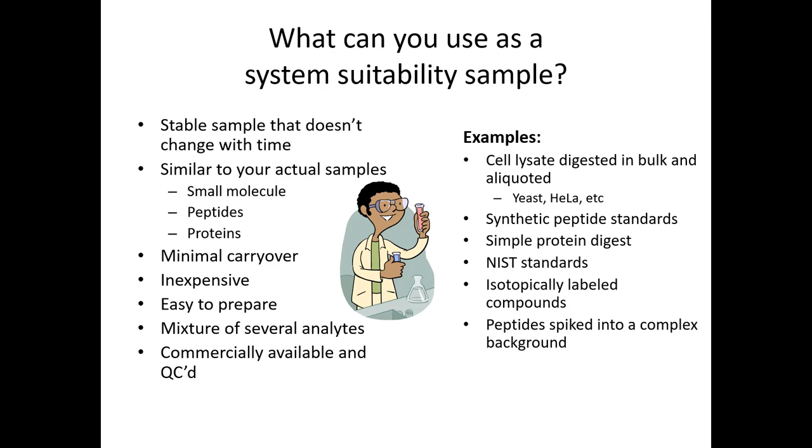Inexpensive because you're going to be using it a lot, or you should be using it a lot. Easy to prepare, so you don't want something that you have to go through a whole day process to make enough samples for a few weeks, because that's just too time consuming. Ideally, a mixture of several analytes.